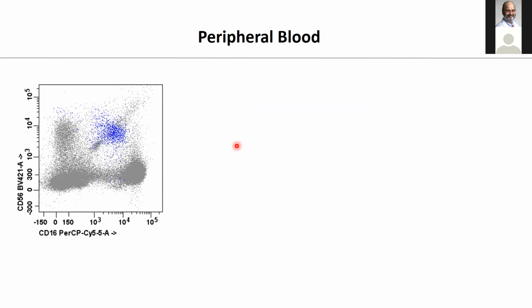But for immunophenotyping leukemia and lymphoma, we don't generally have to worry about all those different subsets of NK cells. We want to be able to go in and look for deviation from normal. So we just want to know what normal in general looks like. And when we see deviation or difference from normal, that's when we get concerned that we might be dealing with some type of neoplastic or malignant process.